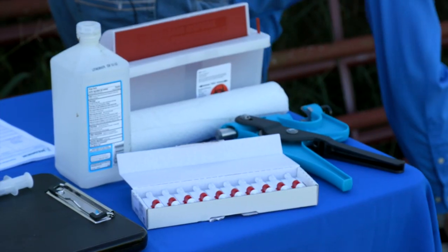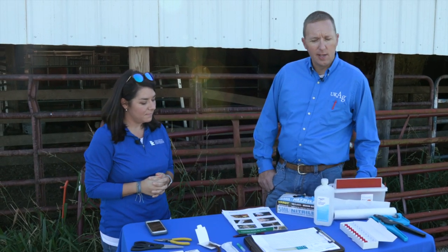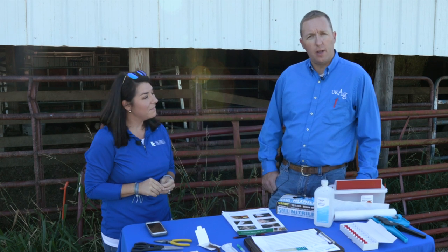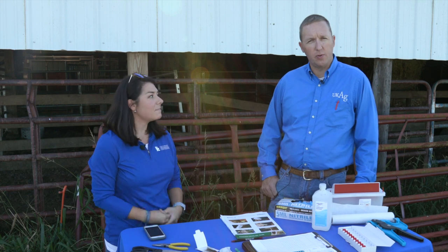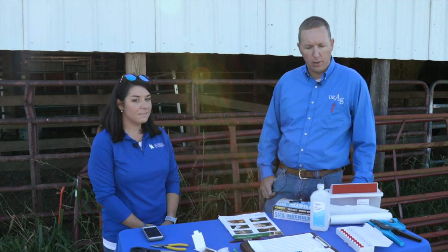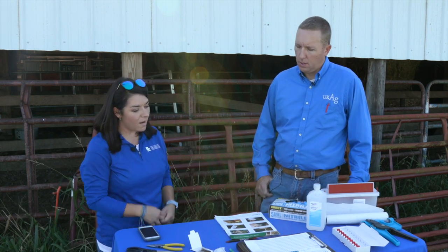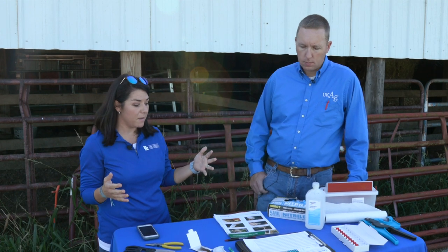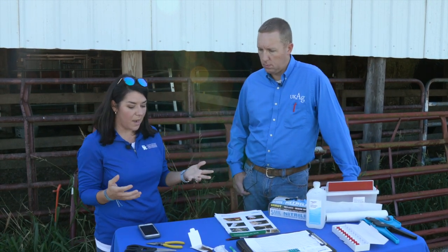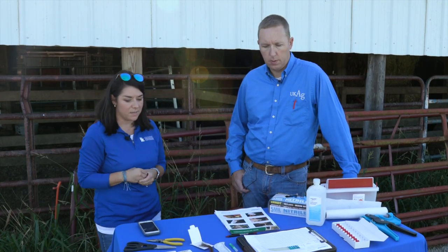As of today we've got three different types of samples that we can take, and it kind of depends on the lab that you're working with and your goals and aspirations as to what you're doing. Some of these samples probably differ a little bit from those in a purebred sector versus those in the commercial sector. So what do we have here today as far as what different options you have and what tools we need to start off with?